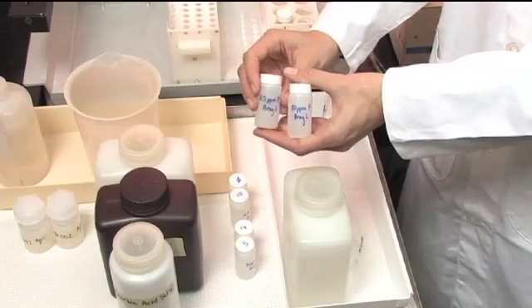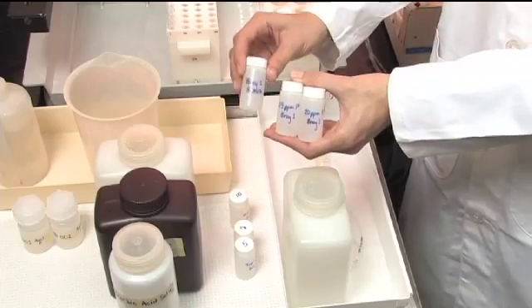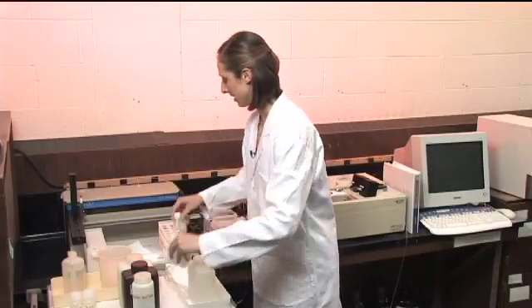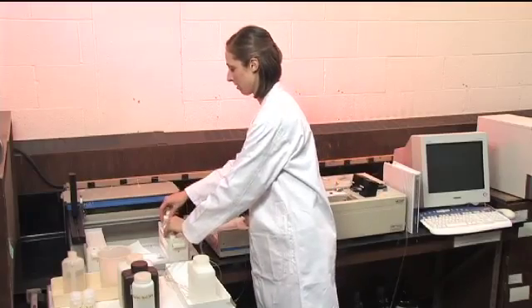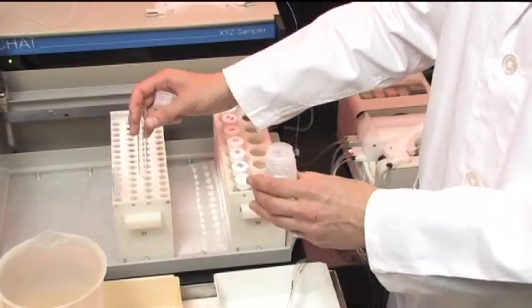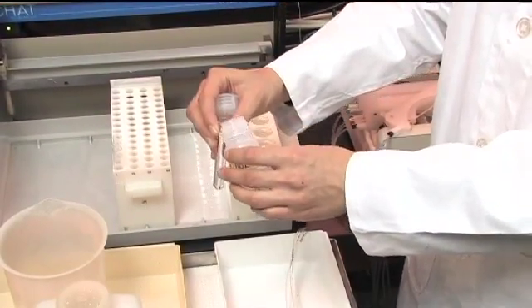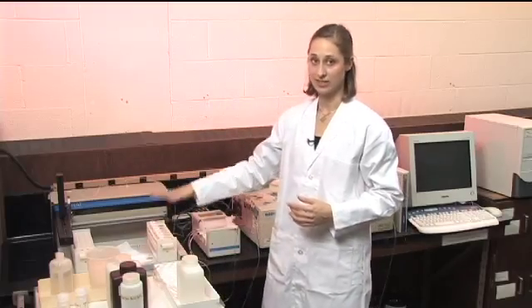You also need to have your standards prepared so that you can make a curve and establish the relationship between the color and the concentration of the phosphate. The standards range from 20 parts per million phosphorus down to 0.5 parts per million phosphorus, and they are in the same matrix as the sample, in the Bray solution. You always need to have a blank as well, which is just the matrix solution. We'll put the standards in the standard rack on the autosampler, and you only need about 10 mils or less of sample.